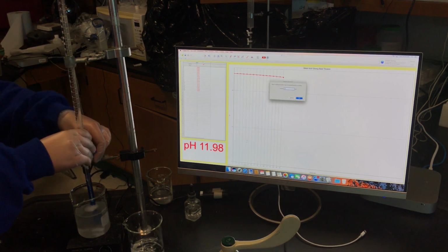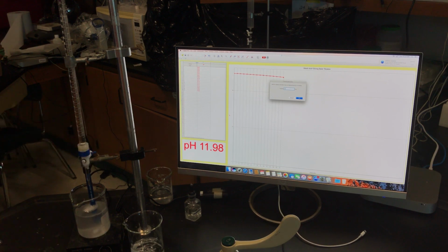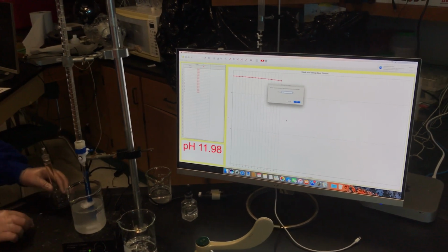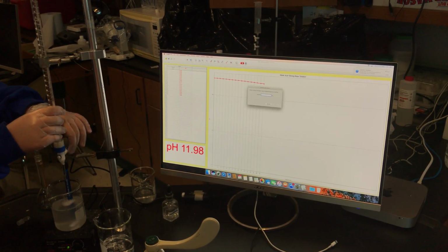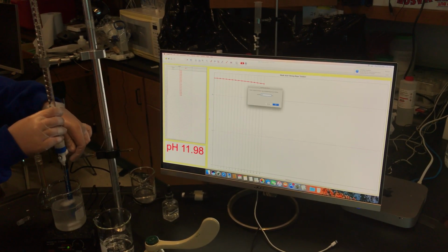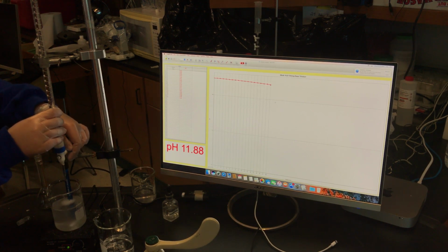Why is this not? Oh, can you just move now? Yeah, I can. Thank you. Sorry, we just moved you. Oh, it's starting to drop a little bit. I'll keep it in there.